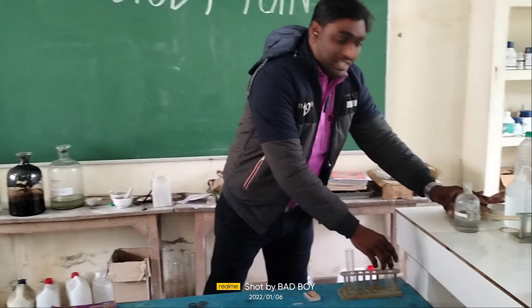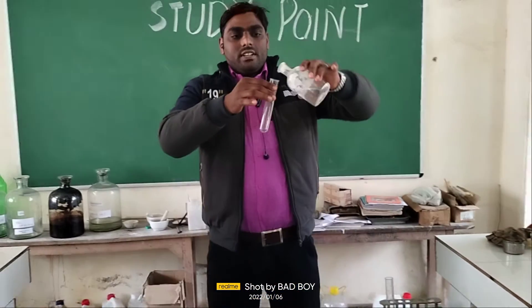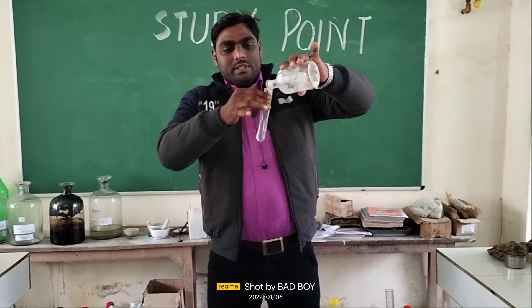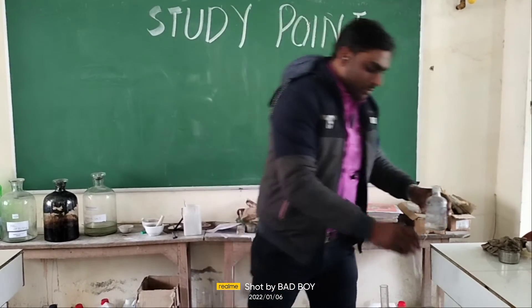First we have a base. This is sodium hydroxide. And this is a boiling tube.